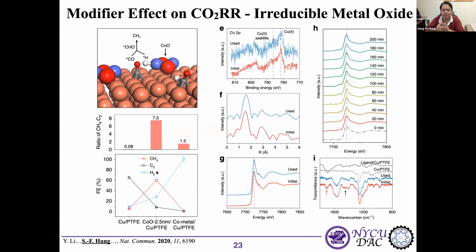To prove this argument, we conducted in situ XAS with time evolution under the operation of 220 milliamp per centimeter square. We did not observe any edge shift, and the shape of the white line stayed the same. So we believe the cobalt oxide cluster is stabilized by the ligand incorporation.